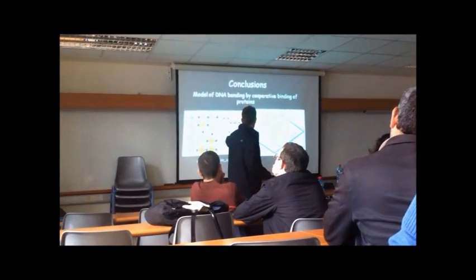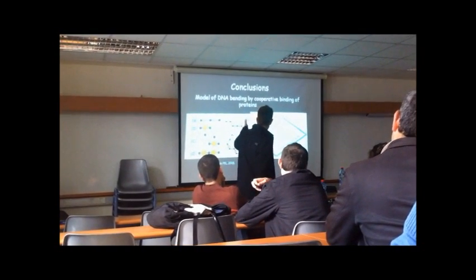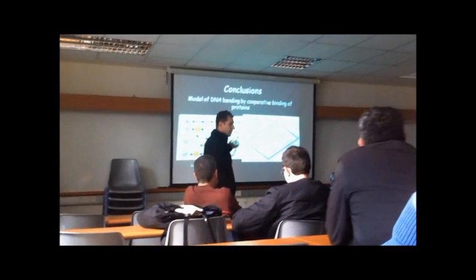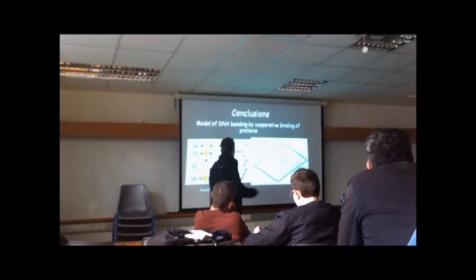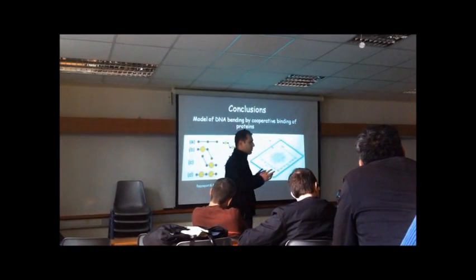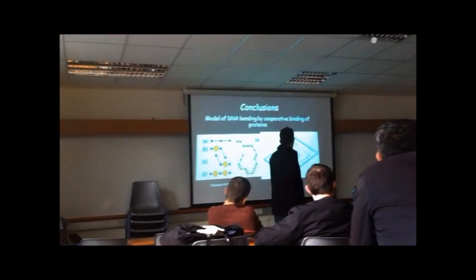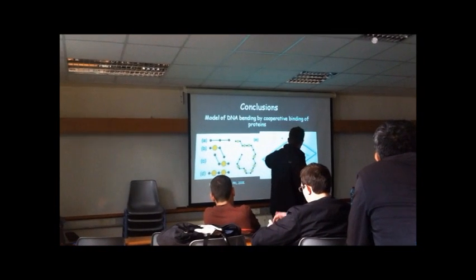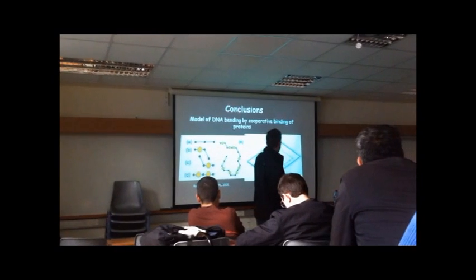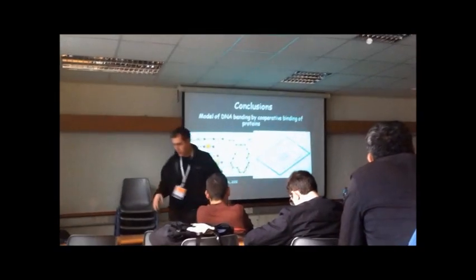For example, you can see in plot E a typical chain, where in different regions of the DNA there's different flexibility. This is the different amount of proteins that are bound to the DNA. And to the right, you can see an illustration of a typical experiment in the TPM setup. You can see that, for example, when one protein occupies one segment, then there's a bend, and where there are 2 proteins occupying 2 neighboring segments, there's a straight line. Just for illustration.